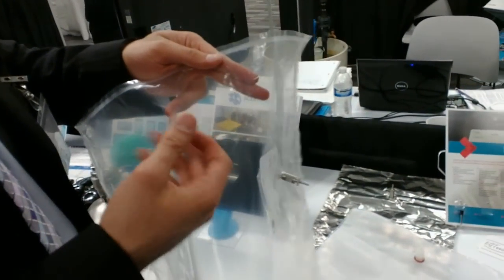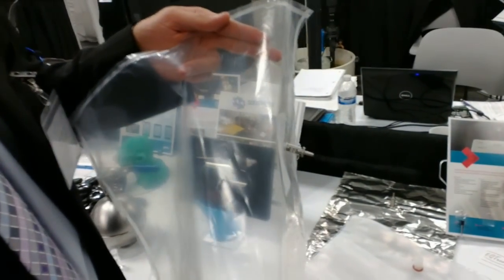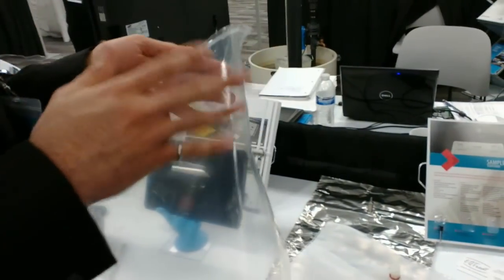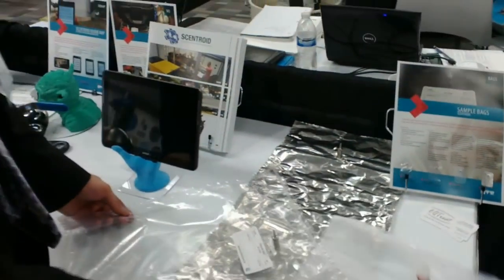So this is a Tedlar bag and it's been the standard for 20 years. It has lots of issues we know — water absorption, it has a background odor we have to clean, and also it's controlled by one company, DuPont. If you remember a few years back they didn't want to sell it anymore. It's quite difficult to find Tedlar nowadays.